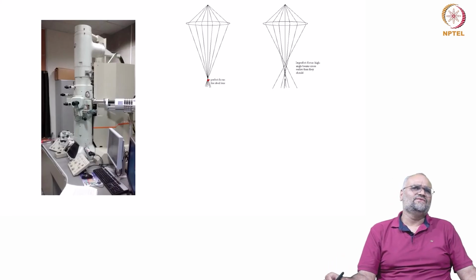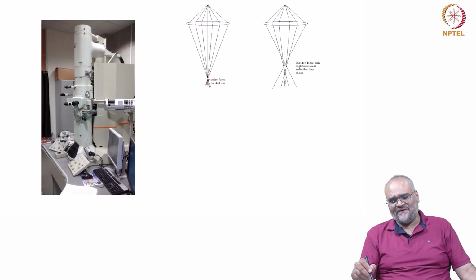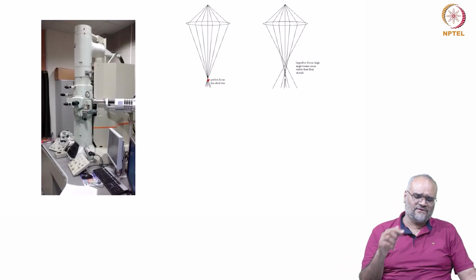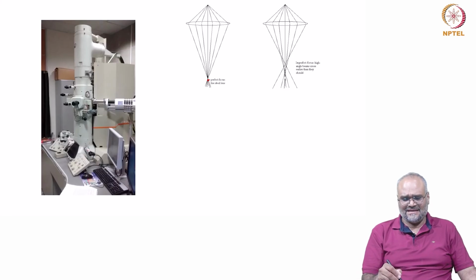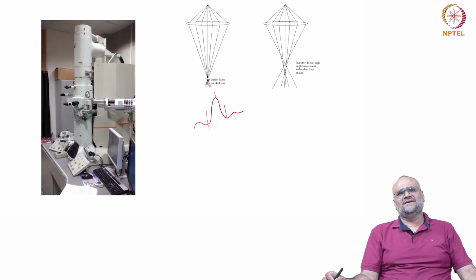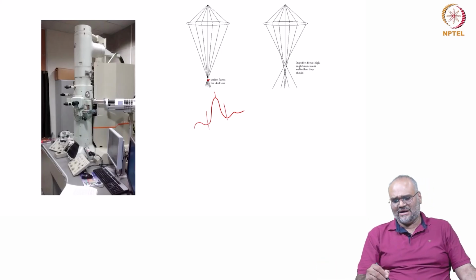As a consequence, if I think of how the point spread function of such a probe would look, so this is like I take a Fourier transform of the probe, then in an ideal case it would appear like the sinc function with a very narrow peak. Depending on the diffraction limit, your resolution or your probe diameter is limited, but this gets broadened due to the consequences of the aberrations that you have, and it appears like this.